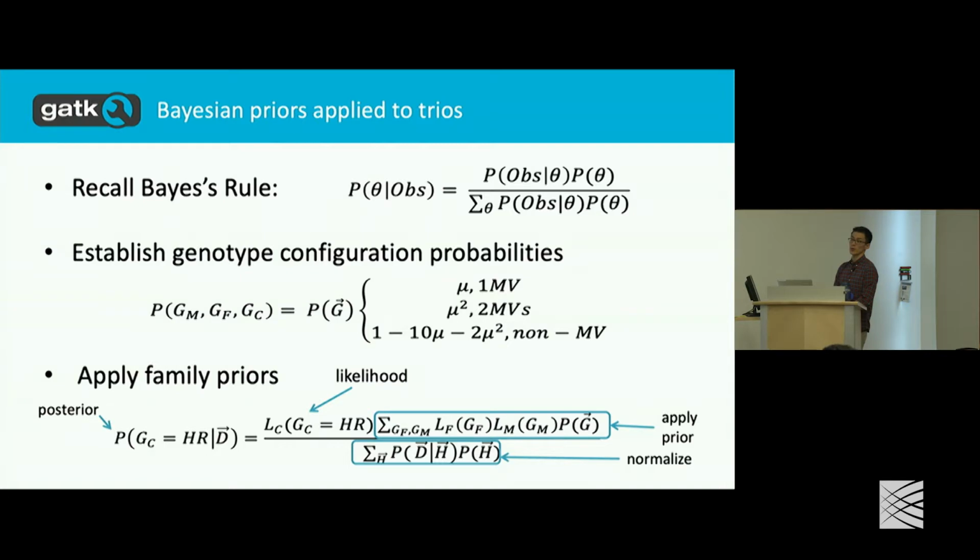This is a tunable parameter, and the recent literature says that the rate of de novo mutation in the human genome is about 10 to the negative 8 or something. So we expect about 30 de novos. Is that true? 10 to the negative 8 power? Yeah. So we expect about 30 de novo mutations.